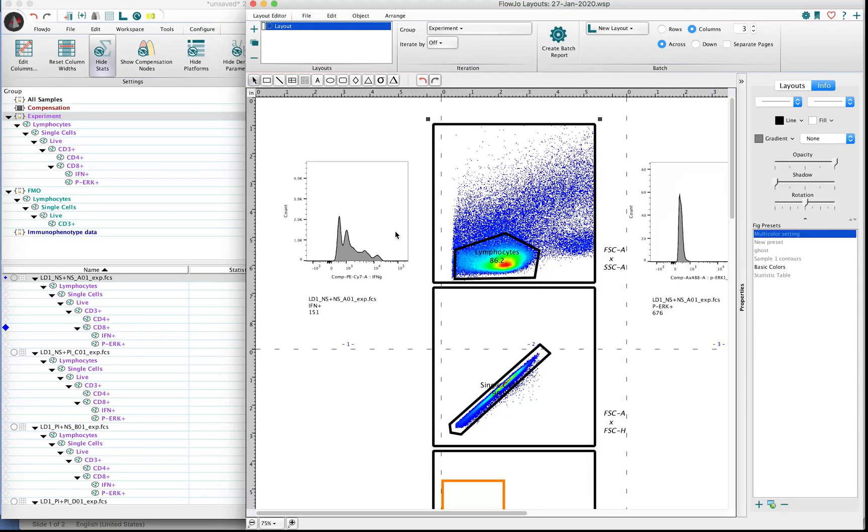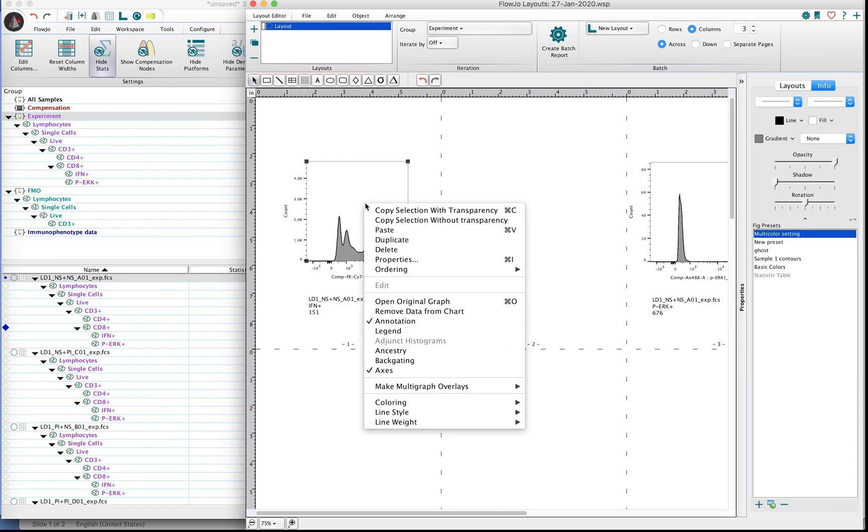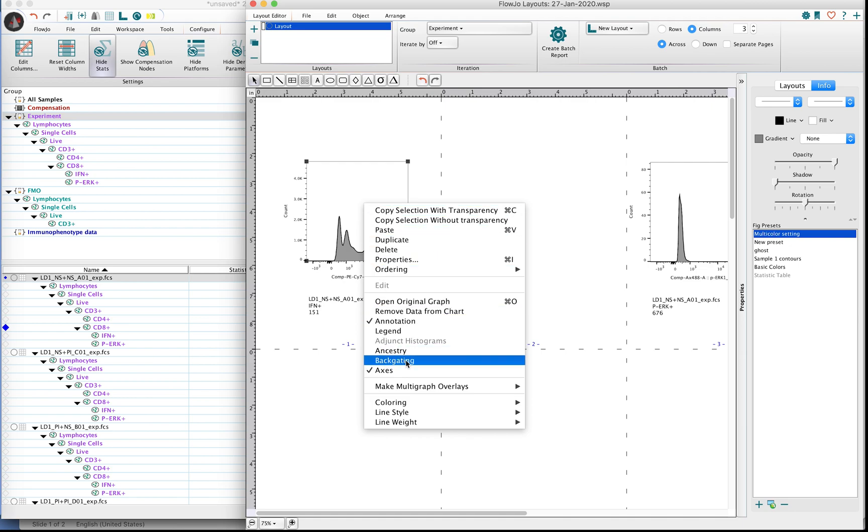Now in addition to the Ancestry, there's also the option to visualize the backgating. So if we right click on the plot, you will notice that directly underneath the Ancestry option is backgating. You can go ahead and click on backgating.